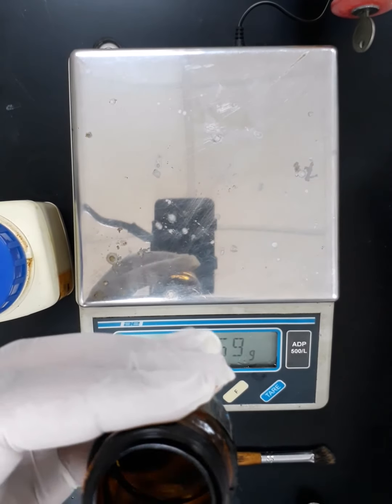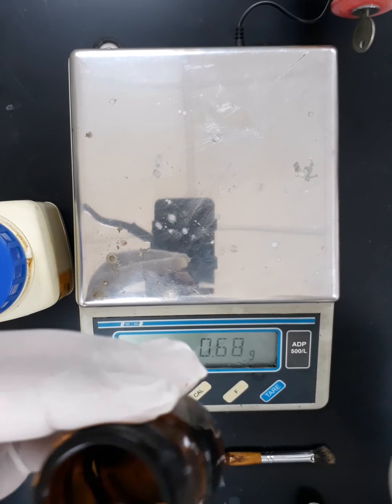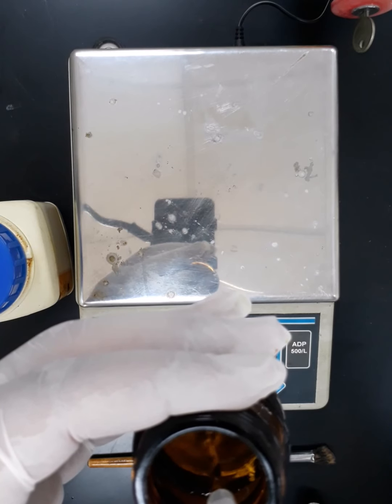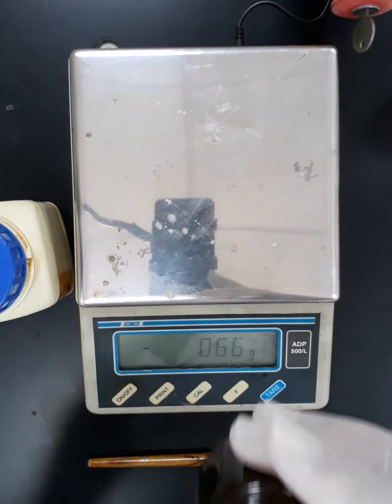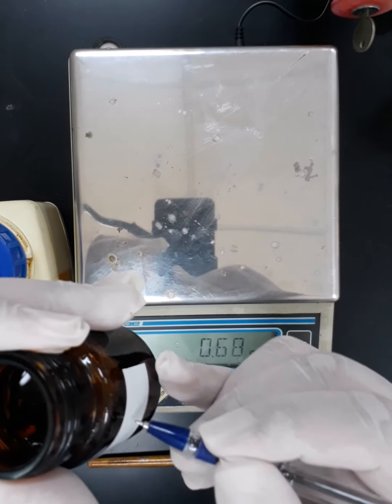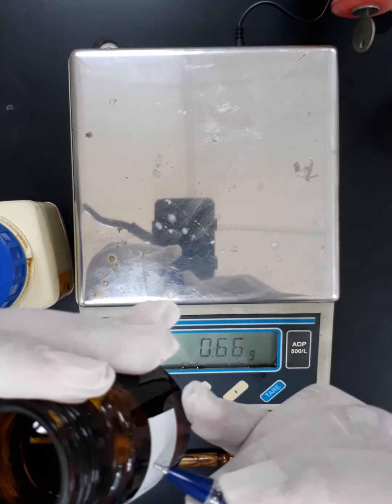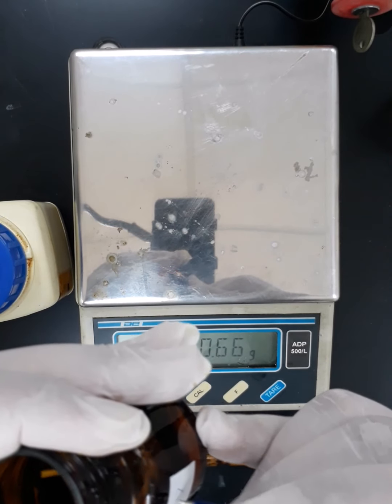Now we are going to add distilled water till the 25 ml mark. So now I have the glycine solution ready, and I will just write on the label here G as an abbreviation for glycine. So this is my glycine sample of 1%.